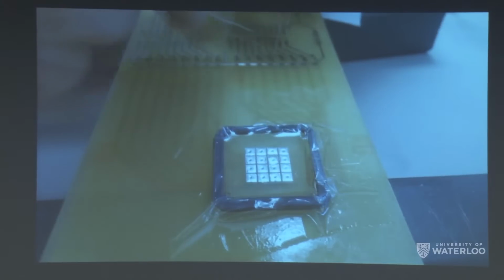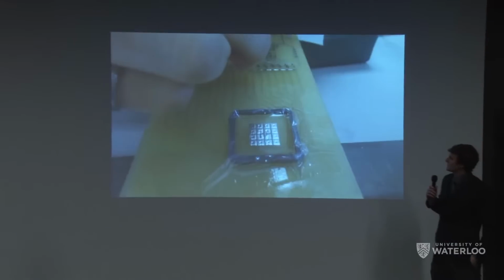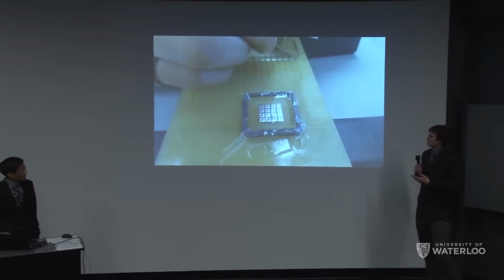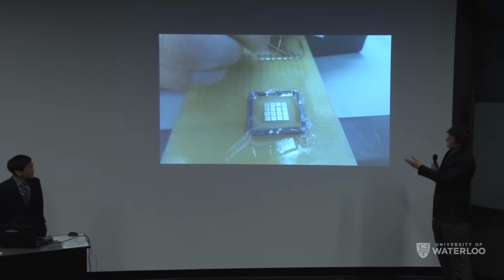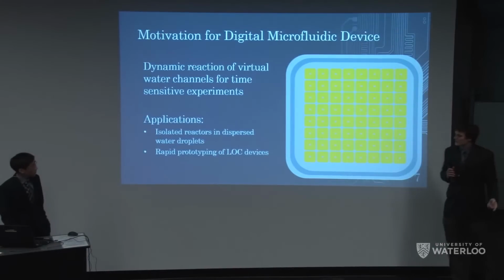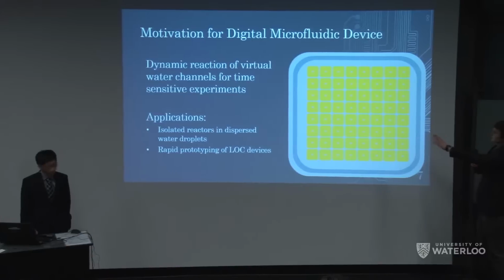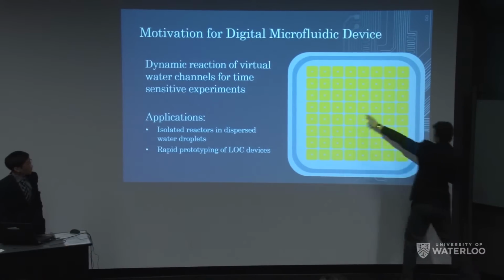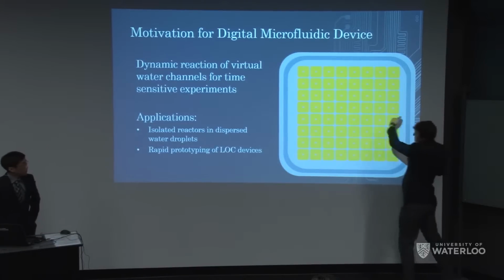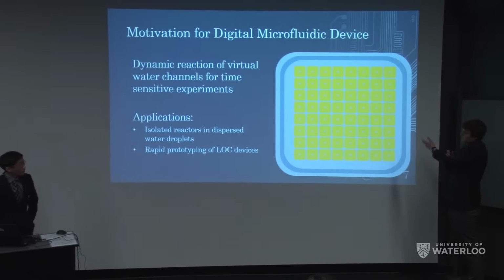As much fun as it is to watch a droplet spin around in a circle on pads, we're not going to do this for 15 minutes. Our motivation was that we envisioned this movement to lead to two main applications. The first application is the creation of channels. Back to the electrode array: if we were to actuate, say, just a linear channel, then the droplet would spread across this entire channel, creating an entire channel of water.